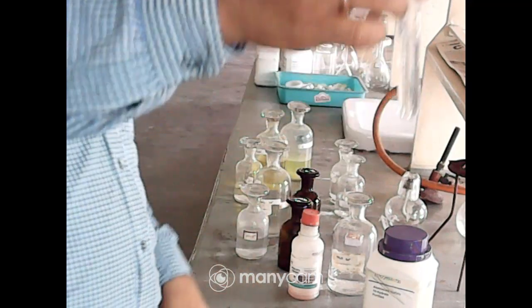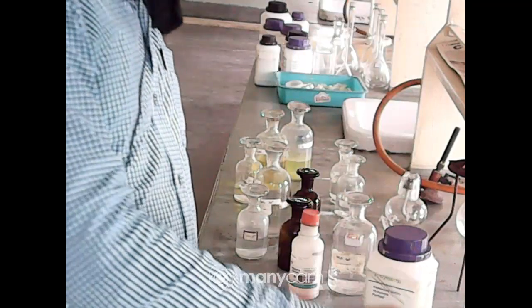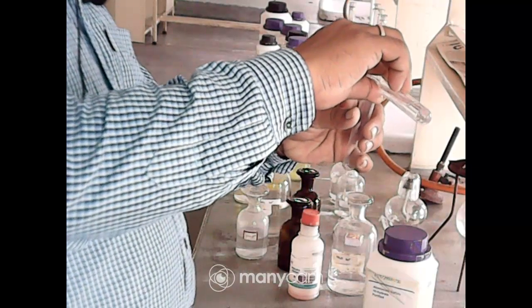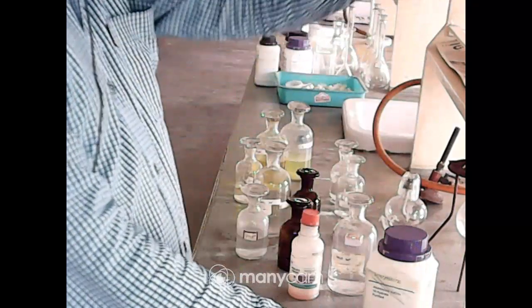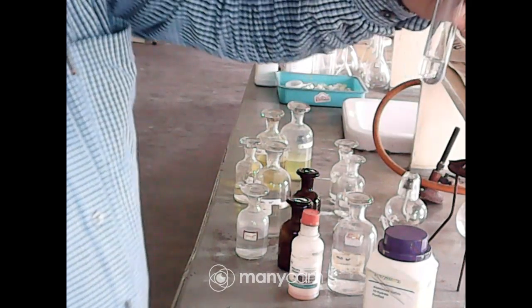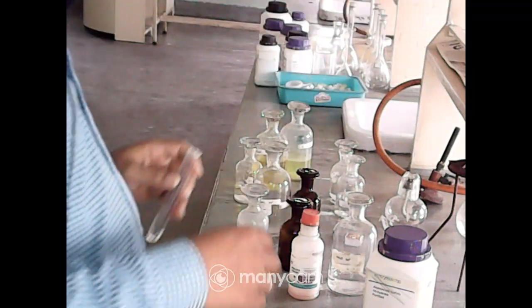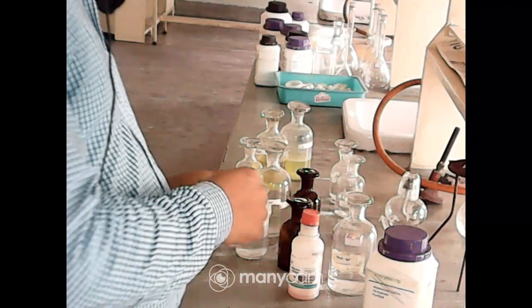Now you can write the unknown sample. You will try for this. Okay, now this is called OS, as we have done before the confirmative test. Now keep it reserved. Take another test tube. Just take a little sample. Just this amount of sample is sufficient for a test. Just this little amount, 2 or 3 ml. The test tube is of 20 ml.